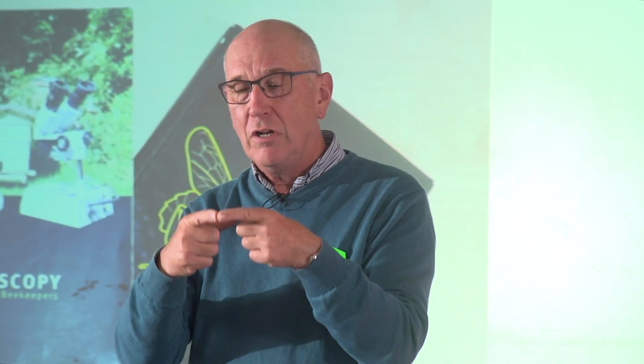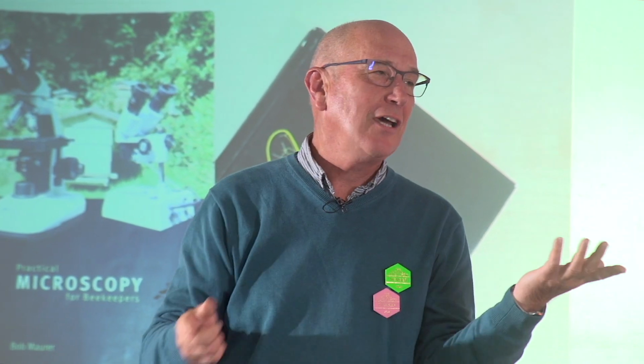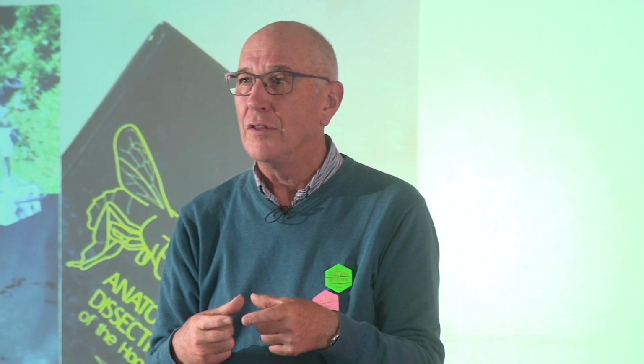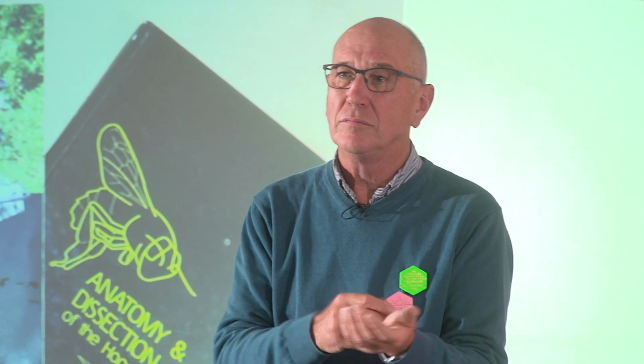But in families, and there will always be exceptions, because you see the forget-me-not is completely different to anything else in the Boraginaceae family. But generally, in families, they're all the same. So you can guess the type of flower, the family, but unless you've got a library to reference it back, and I haven't gone around all of the hawthorns, I've just done hawthorns which are local, and that's the only way you're going to compare. The one that is the hardest is the mustards and the oilseed rapes. They're very distinctive, they've got a netted surface and 3 furrows, but they all look the same, and they all look like propellers when you look down the microscope at them. The only difference in them practically is just the size.